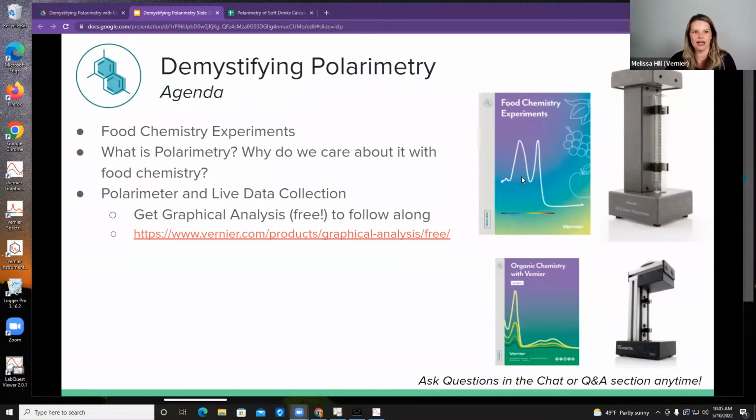So it's a great way to get your students looking at what would actually happen if they got a job as a chemical technician or when they actually go out into the real world.